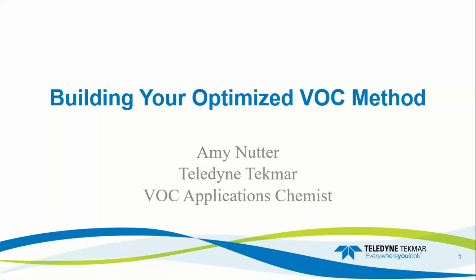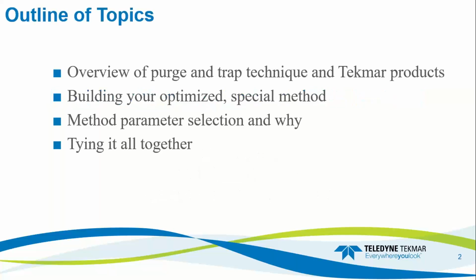Thank you, Shelley, for the introduction. Like she said, I'm Amy Nutter, Applications Chemist here at Teledyne Tekmar, and today I will be discussing how to utilize the tips given in the Method Optimization series and the Moisture Control webinar in building your specialized VOC method. We will cover a quick overview of the Purge and Trap technique and our products, specialized applications and how to build your optimized method, and why we use certain parameters and how they help with the analysis. So we have a lot to cover today. Let's get into it.